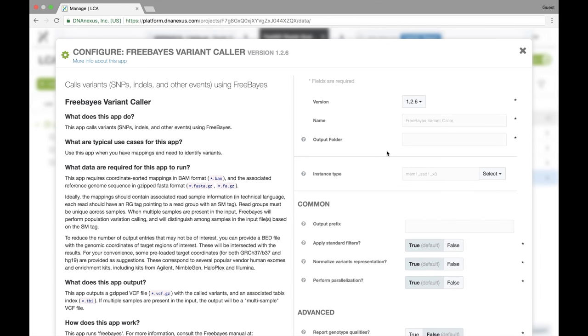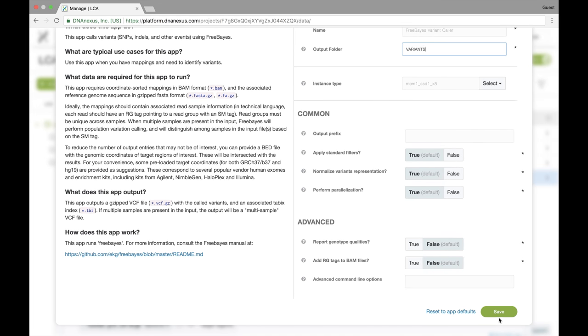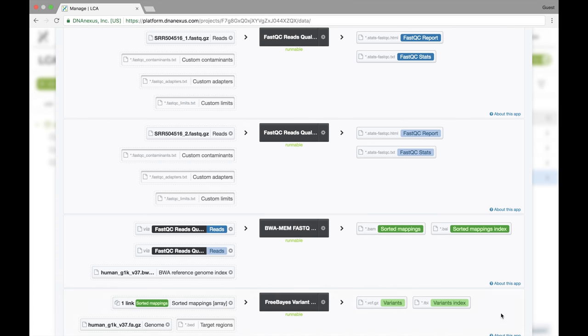And finally, we'll output our Freebase variant calls to a folder called variants. And now we'll save that. So now our workflow is structured and ready to be run.